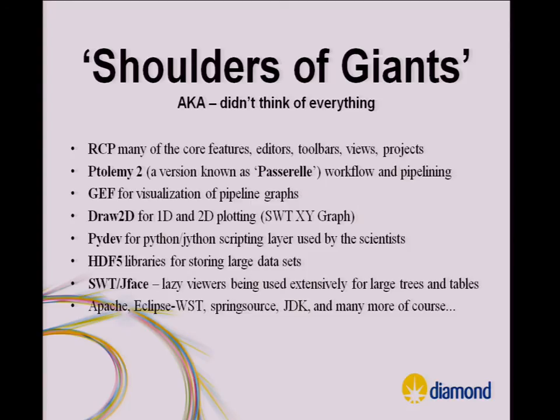We use HDF5, which is a way of recording massive arrays onto disk and interacting with those massive arrays without having them in memory, because typically the information from an experiment is too big to fit in memory. So what you're doing is always giving someone a view. You're trying to pare down the data and give them a window into part of the data. I'll show you that in a minute.